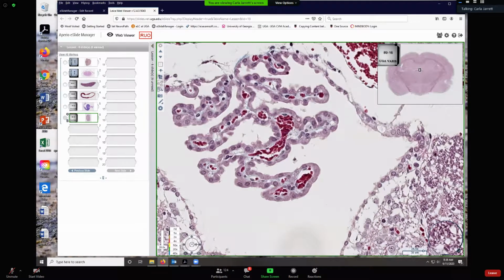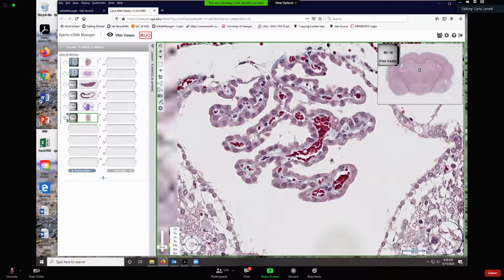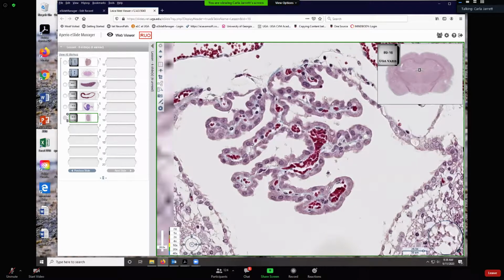The walls will become fenestrated and sealed off by these ependymal cells, and these ependymal cells will pull plasma from the blood vessel, modify it, and secrete it into the ventricle. So where these ependymal cells fuse to the pia mater, they form a special tuft of cells that protrudes into the ventricle. We call this a choroid plexus.